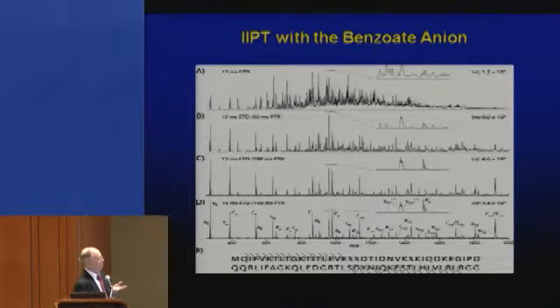And if the measured molecular weight of the protein is higher than the one in the database, then obviously you would conclude that you've identified the right protein, but it must be post-translationally modified. And now you go in and look to see what that modification state is. If you happen to find that the molecular weight you've measured is less, then you've probably got a splice variant. The point is, in a very short period of time, you can identify proteins very quickly from this information.